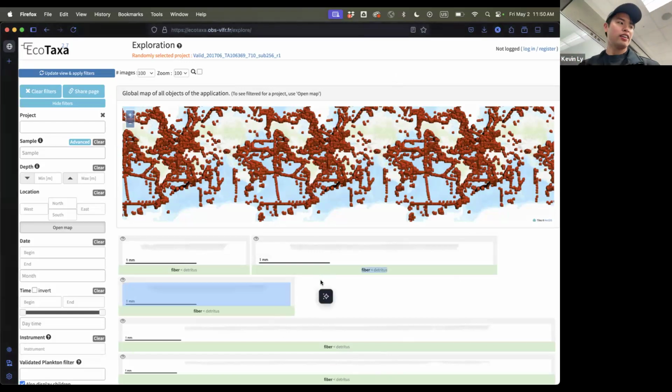All right. Anna, how is this one going? Something, but I'm not sure how. This is not actually Enrico's. Enrico is saying it's Enrico's, but it's not. Okay, but I'm still not sure how. I don't think the Z is moving. Oh, because it's connected to this, and this is bolted in.